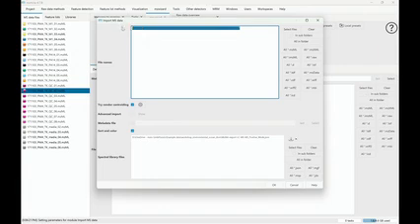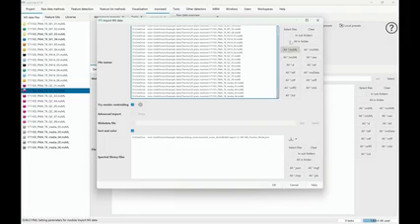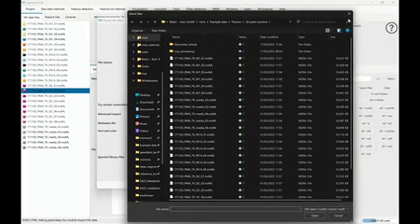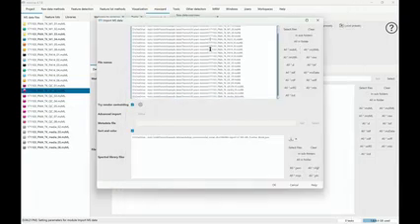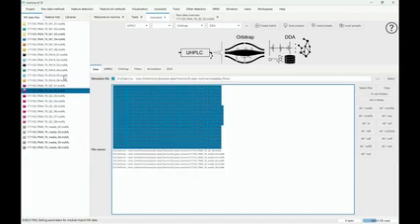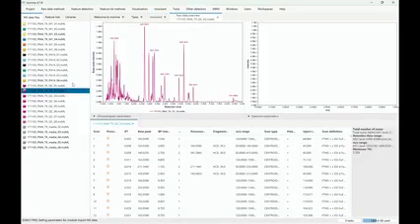Typically you can just go from here and have the import MS data and then also select the same files. So we select the same files, or click on select files, select everything, or we go on all mzML files and then just select a folder, and it's going to be selected and imported. But if you have those files, and everyone has the files who wants to follow along in mzmine on the left side, you can already play around by just double-clicking one of those files, and it's going to open this raw data overview.